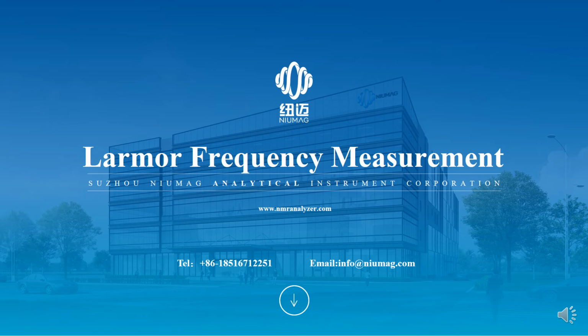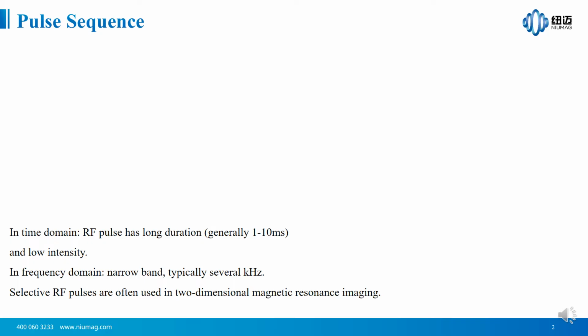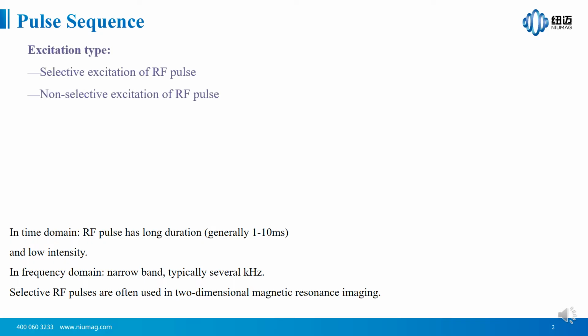Hello everyone. In this class, I will talk about the experiment of measuring Larmor frequency with a hard-pulsed FID sequence. First, let me introduce you to the pulse sequence.